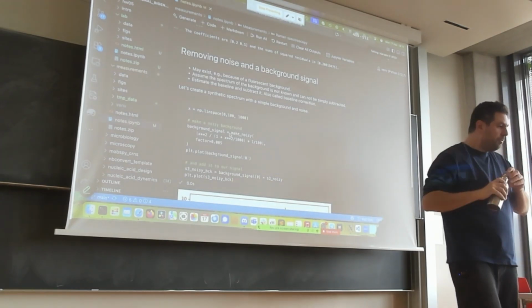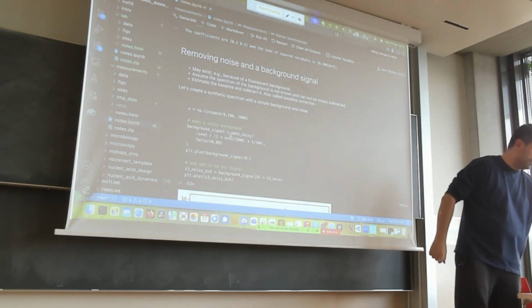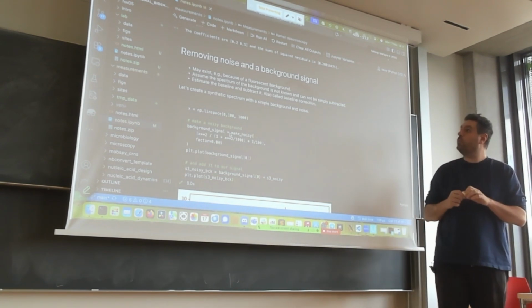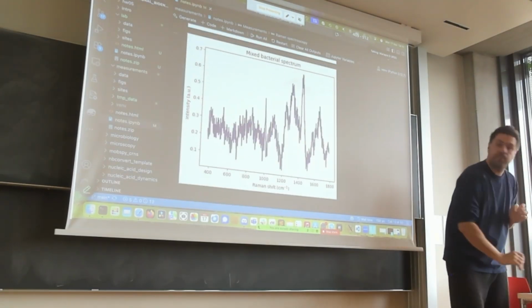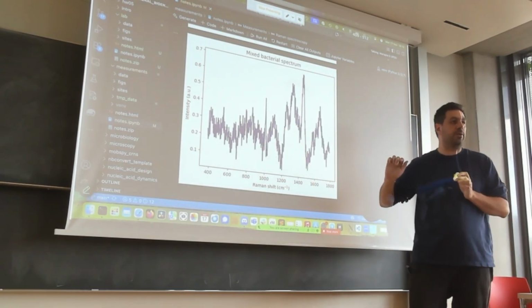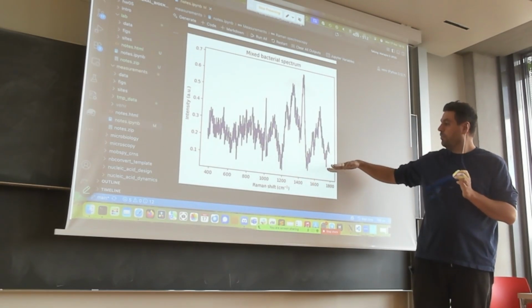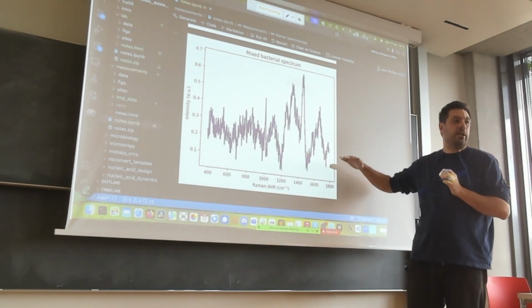And the reason is, it's a super nice algorithm. I really love it. But it is perhaps not super practical for this purpose because when I showed you this spectrum, the so-called background signal has been already removed. So it is already something which has the baseline here at 0. This is not what you really get.